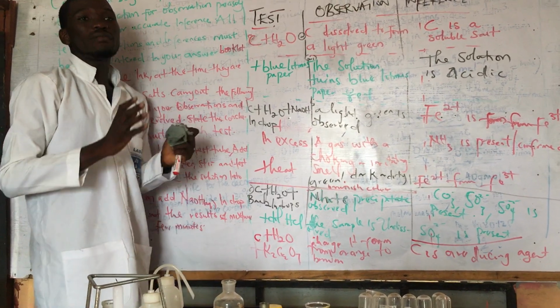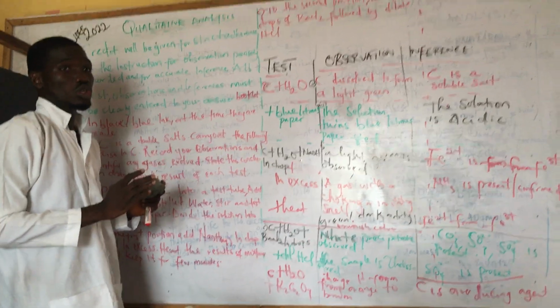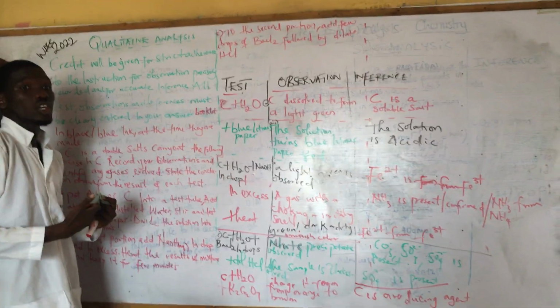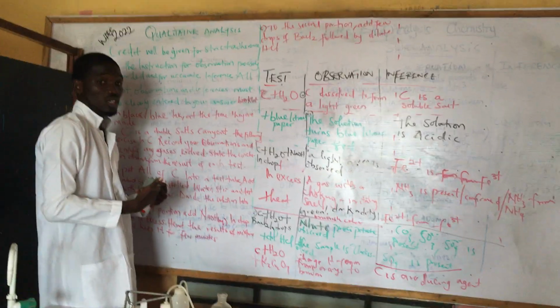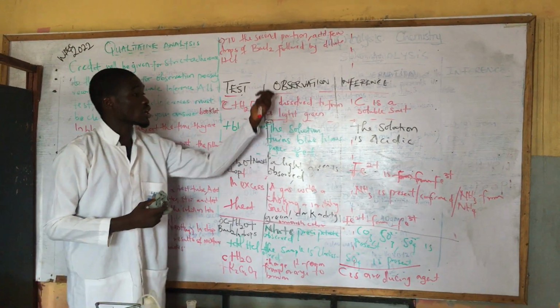So guys, I've explained in detail the 2022 sample or a guide of the qualitative analysis test. And we have the test, observation, and inference.